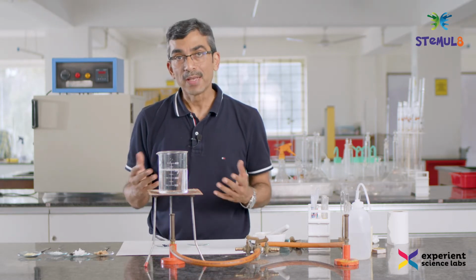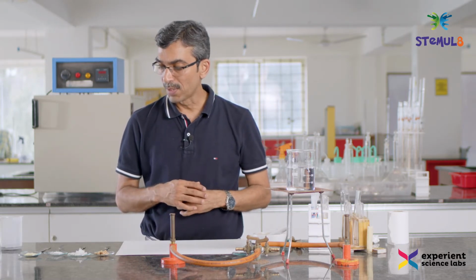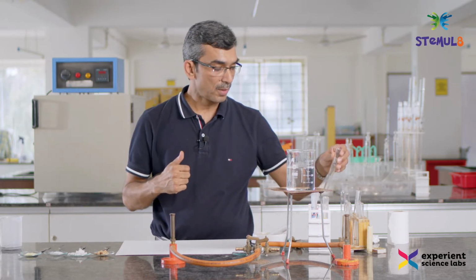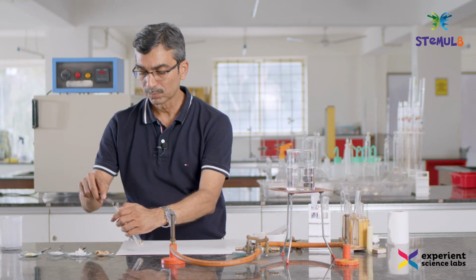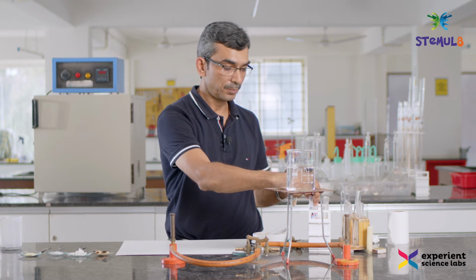We will move on to the next nutrient, which is protein. For protein, I am going to use ground peanut, and maybe I will use boiled rice. So I will take a bit of ground peanut in the test tube, add to it biuret reagent.